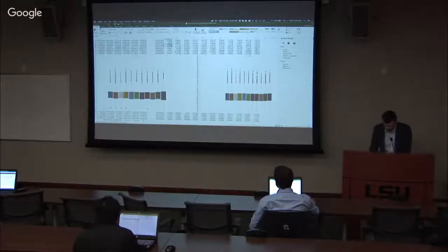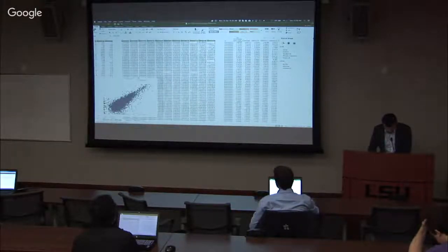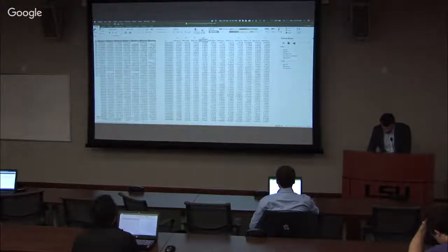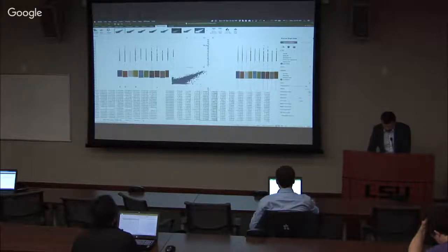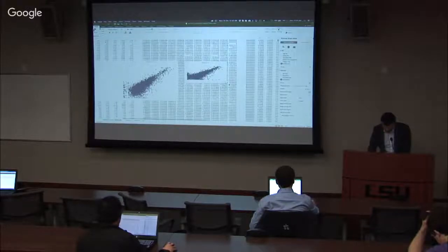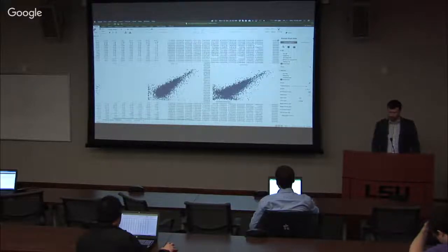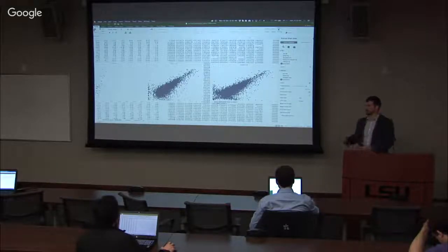So let's go ahead and look at what we were doing before. So this was 721 and 634. Okay, so this is what you get, and you can also eliminate the threshold if you want and see what will happen if you just align everything.